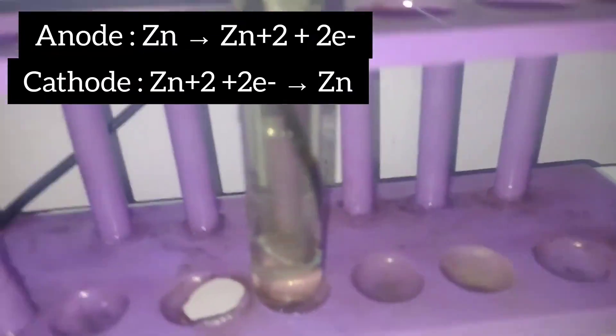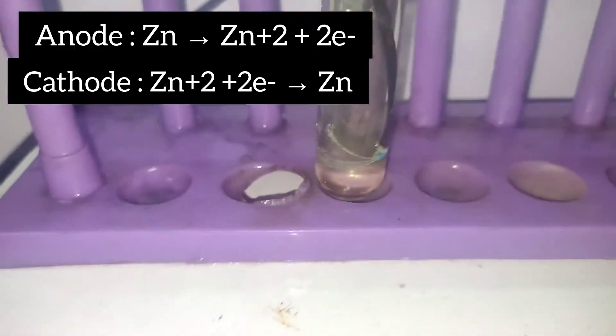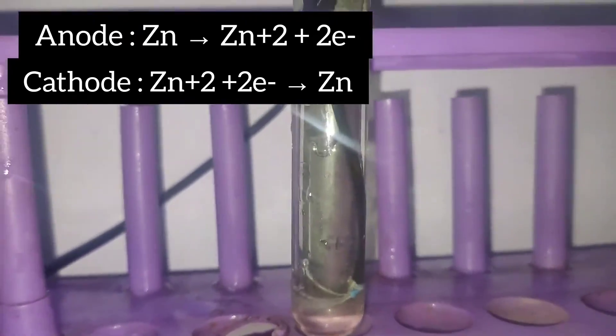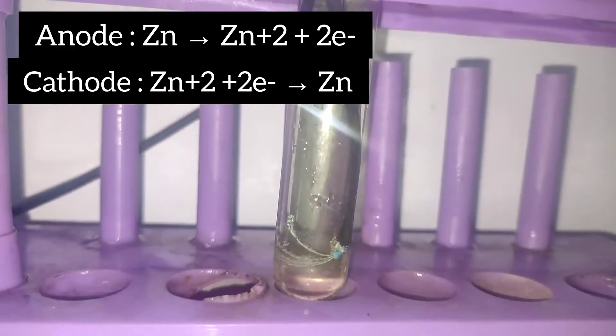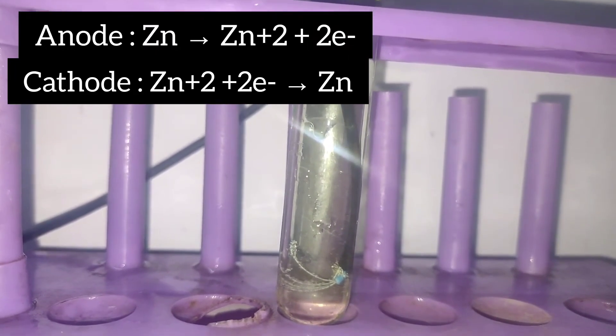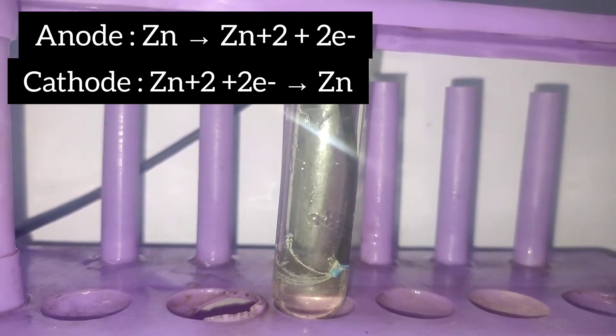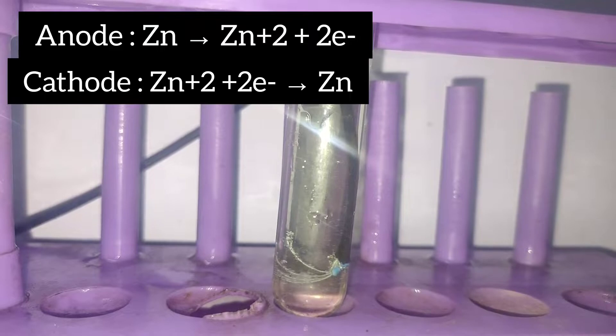Already you can see — this was a copper wire and was the color of copper, but now you can see the color of the wire has changed to a silver color. That is an indication that our zinc is being deposited.